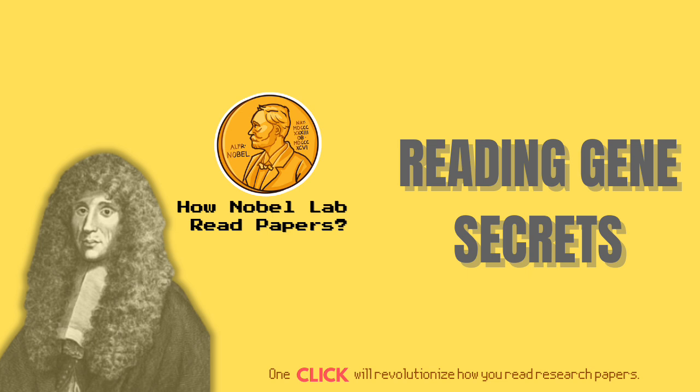But maybe one of the coolest things was how it directly detected RNA splicing. Right. How did they actually see the splicing events? That seems tricky with short reads. They looked for reads that spanned across 2 different exons, reads that physically crossed an exon boundary. They called them splice crossing reads. Microarrays and older methods couldn't really do this directly. They inferred splicing. RNA-Seq provided direct sequence-level evidence of a splice having happened right there.